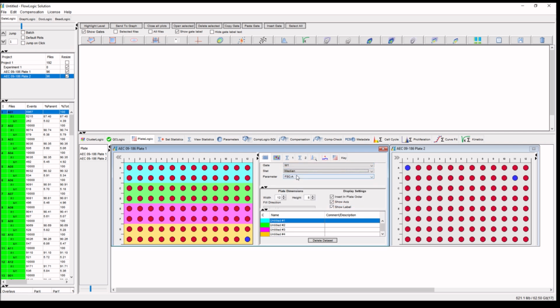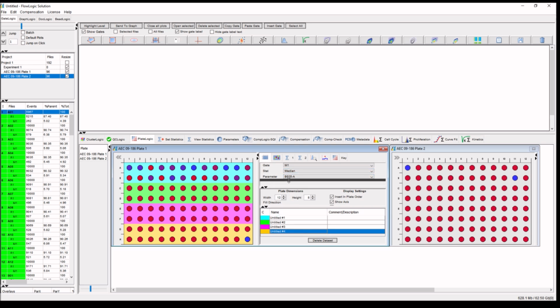median, and B525, this is group 1, this is group 2, we can see that it is different, group 3 is different. So if we want to get all the groups set exactly the same, it is enough to tick the box and everything gets set consistently in the same way for all of them.